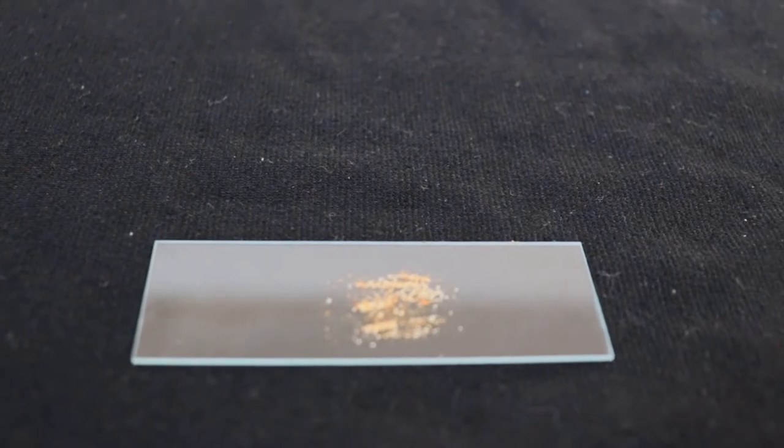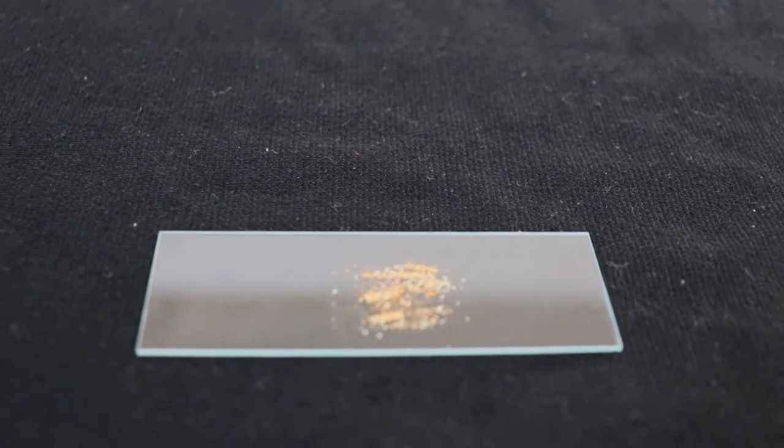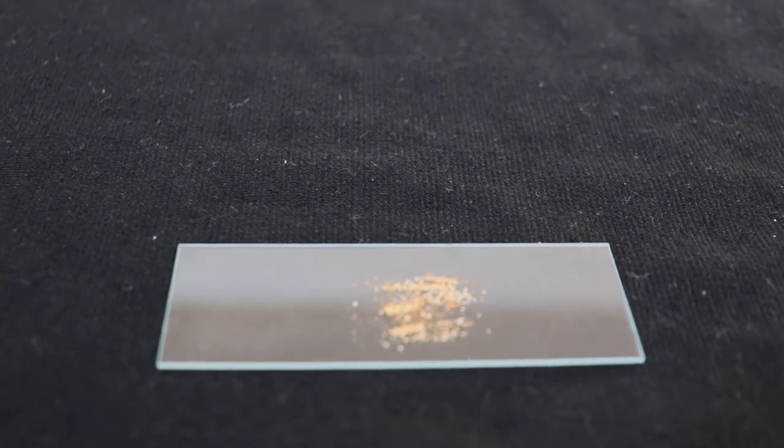Okay, this is seasoning salt, it's a powder, so let's take a look at this one inside the microscope.